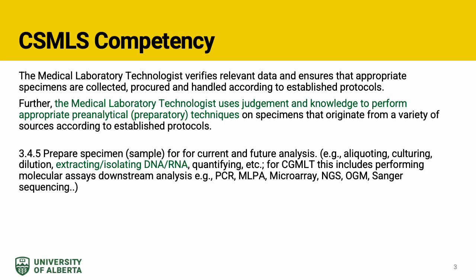The content of this presentation applies to Competency Category 3, Pre-Analytical Phase, of the 2024 CSMLS Pan-Canadian Competency Profile. In particular, Competency 3.4.5 states that a clinical genetics medical laboratory technologist prepares specimens for analysis, including the extraction and isolation of nucleic acids. If you are preparing for the American Society of Clinical Pathology's board exams for molecular biology, the content of this presentation would apply to Section 2, Molecular Techniques, Category A2, Manual Nucleic Acid Isolation Techniques.